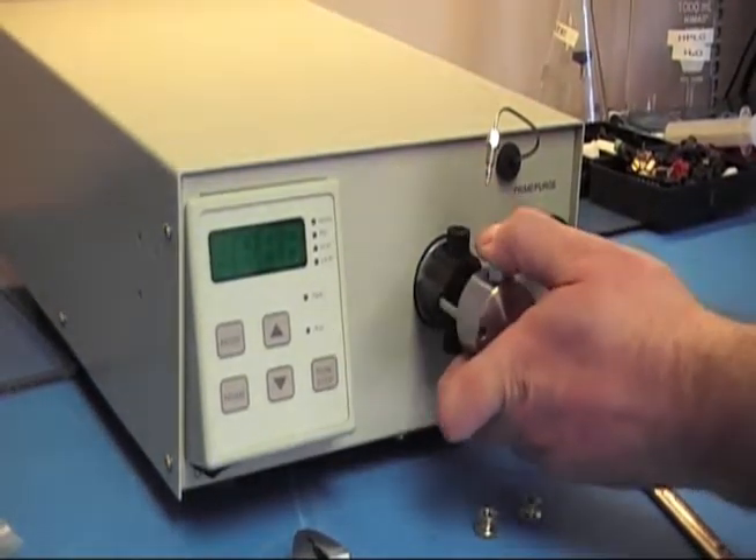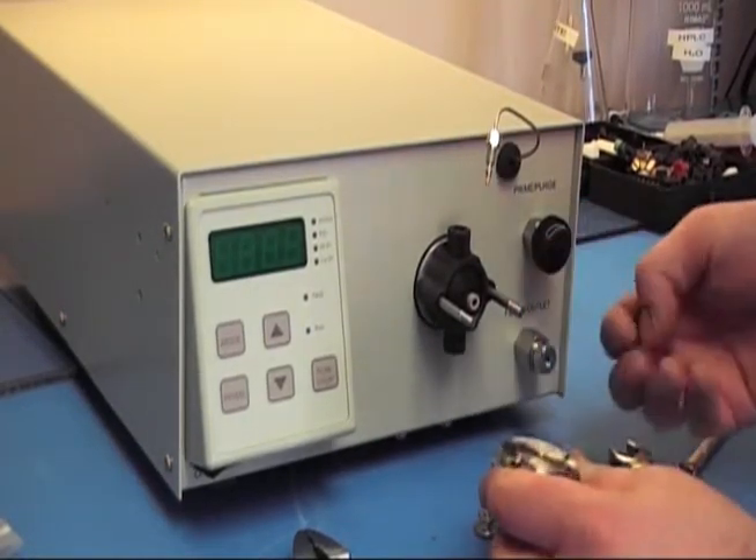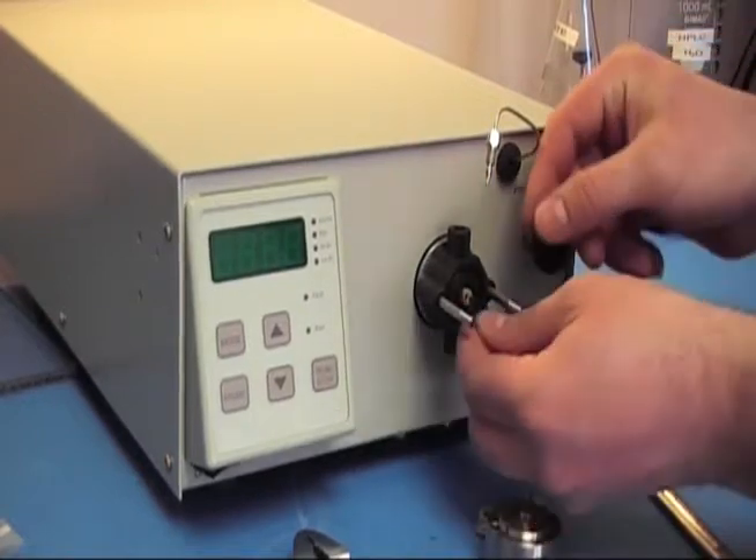After that, you can grab the head and just pull it off. If any of the gaskets or backup washers come off with it, go ahead and slide them back on so you can keep track of them.